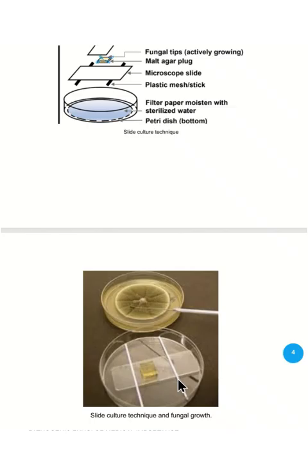This is if you want to study the growth pattern of the fungi, because it takes a very long time. And this is usually used by the researchers who study or compare the growth or the spread, or the type of mycelium or the division of the mycelia, the hyphae, in different types of fungi. These are the three methods for microscopic identification of fungi.